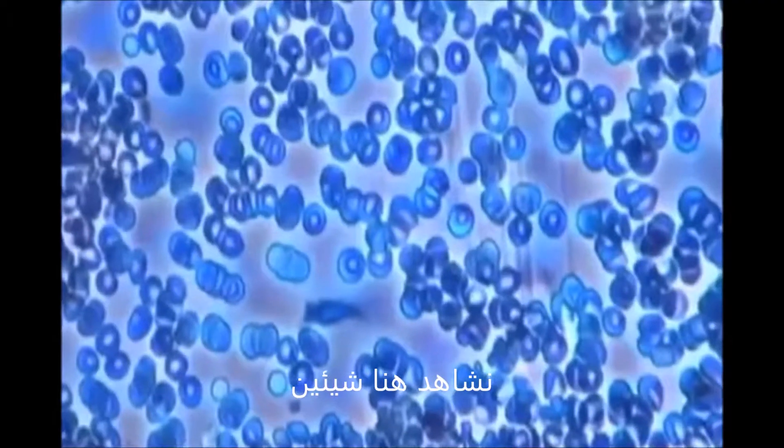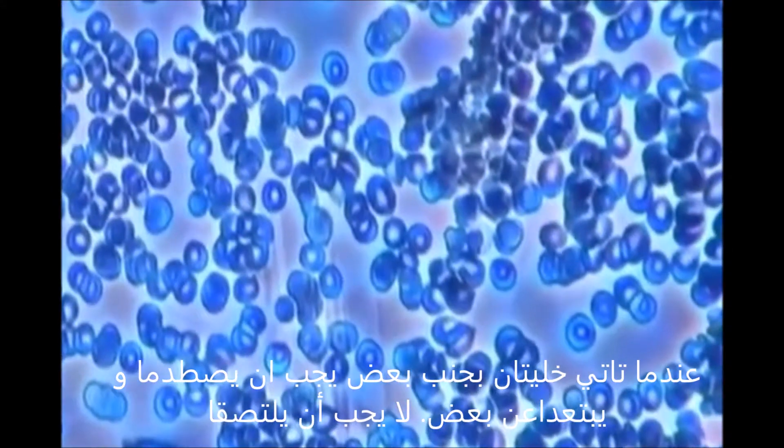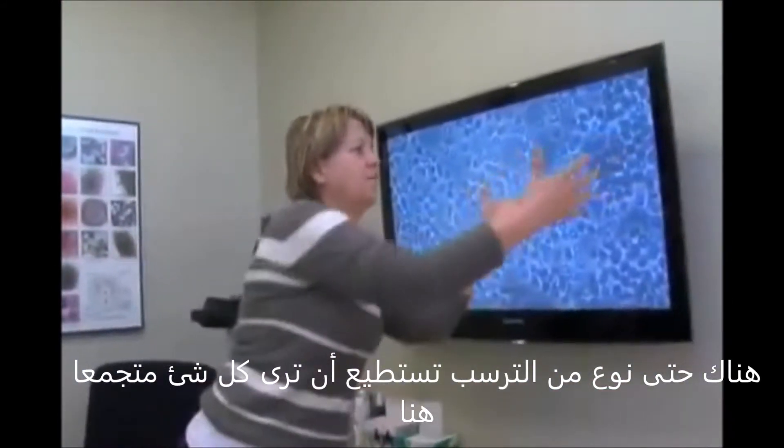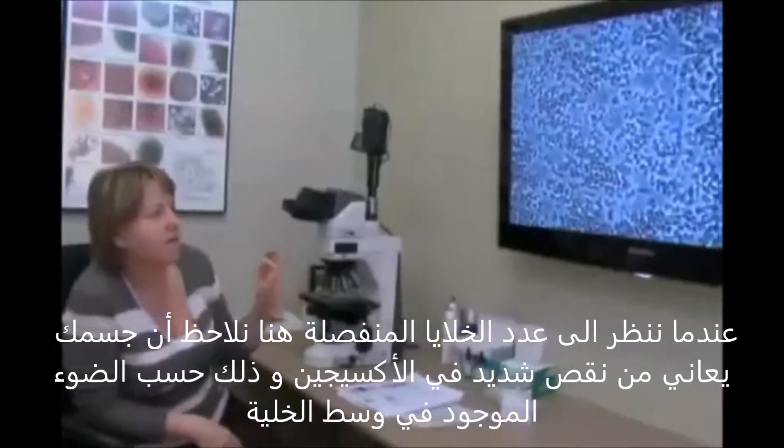So there's definitely room for improvement here. Your blood should have enough electric charge so that when two cells come close together, they bump one another — they should not come and stick together like this. Even a little bit of so-called sludging, you can see how everything kind of groups in. The ideal picture would be that absolutely every one of your cells is separated. Now be looking for the amount of separated cells here.